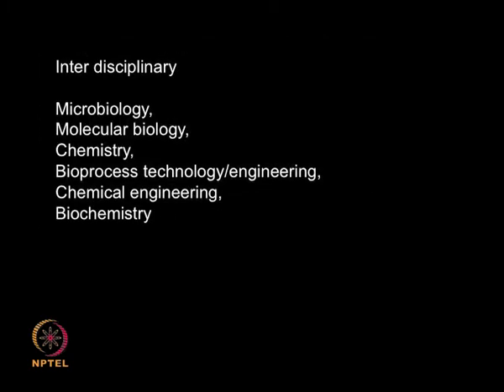So you see, chromatography is a highly interdisciplinary subject. We need to have expertise in so many different disciplines. Microbiology comes in, molecular biology, chemistry, bioprocess technology and engineering, chemical engineering principles, biochemistry principles, and so on. So we need to consider all these aspects when designing a chromatography system for the purification or separation of a protein.